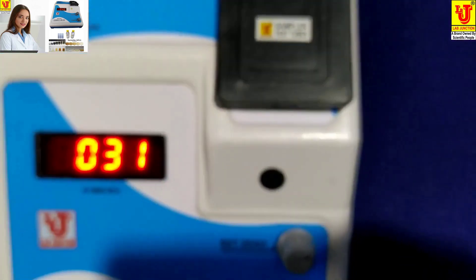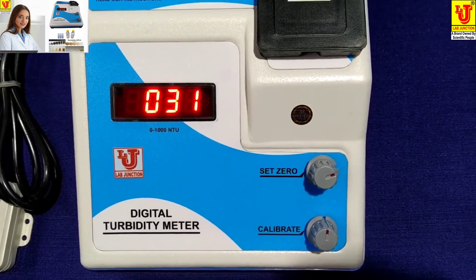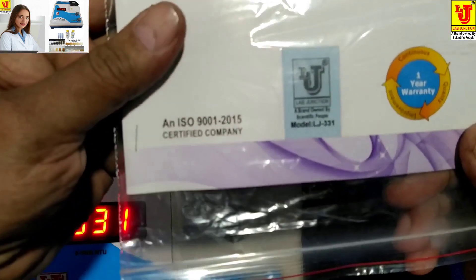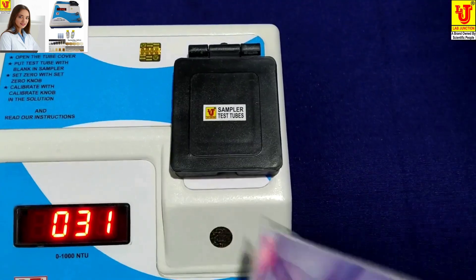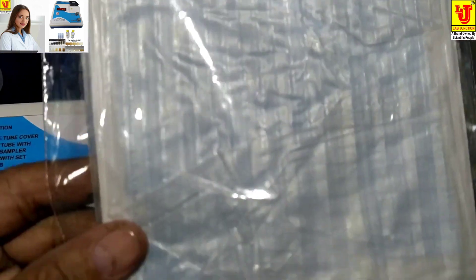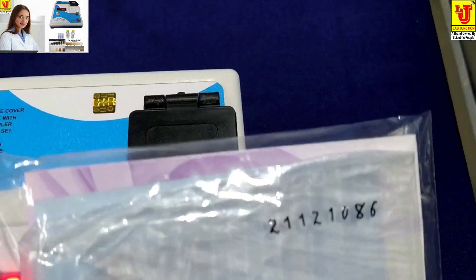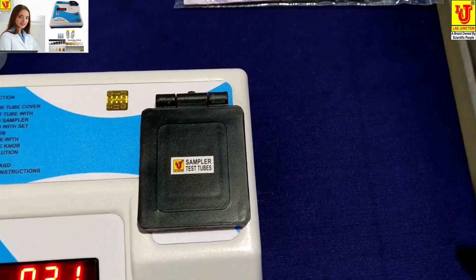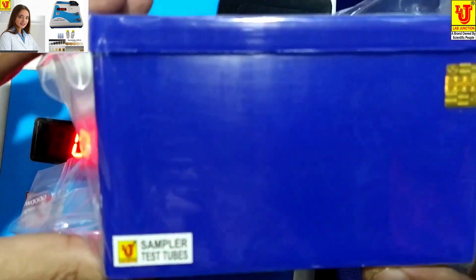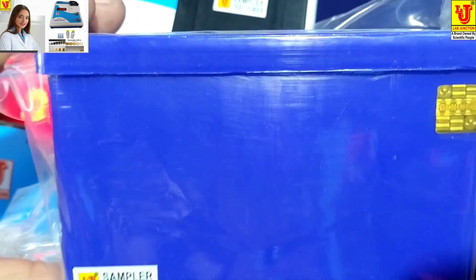With this instrument, the supplied accessories are: an instruction manual with warranty card for one year, and a dust cover. For the instrument, three test tubes of 30 mm diameter and capacity 30 ml are included.